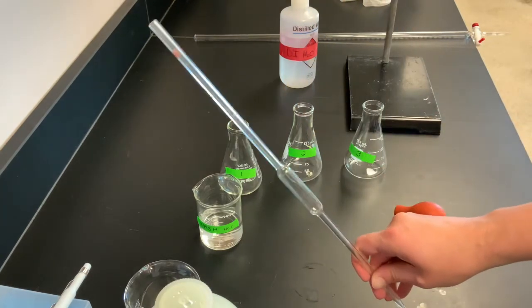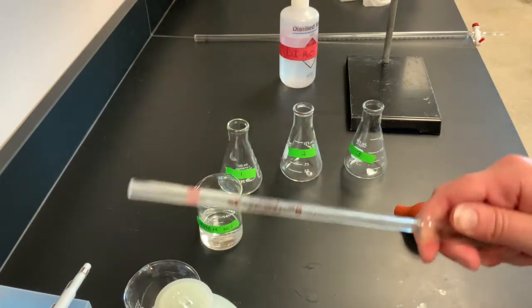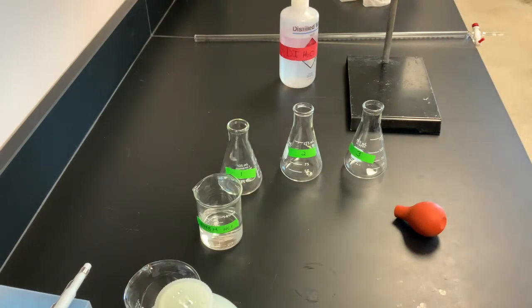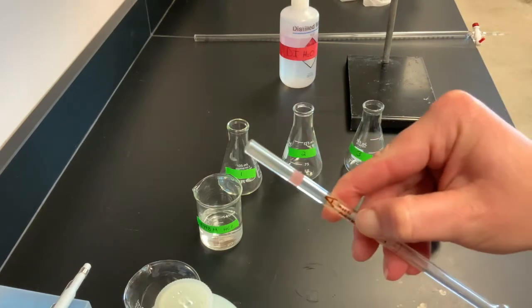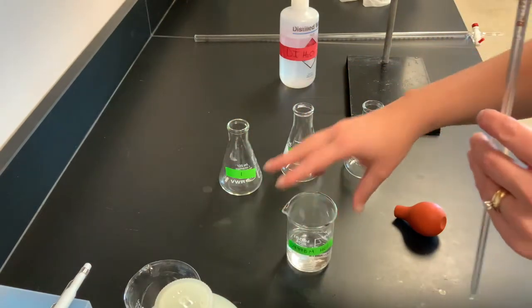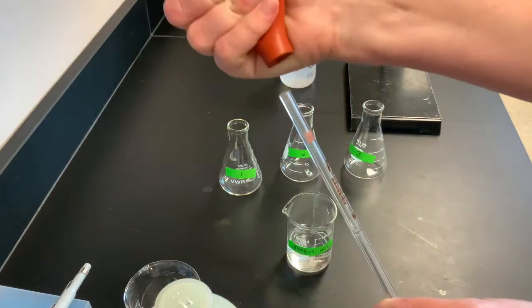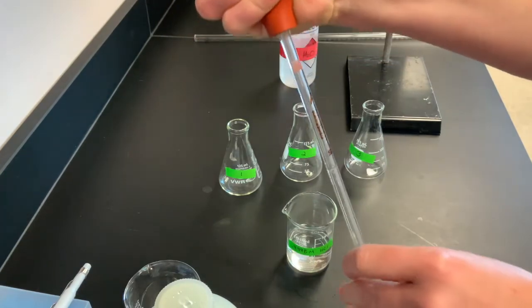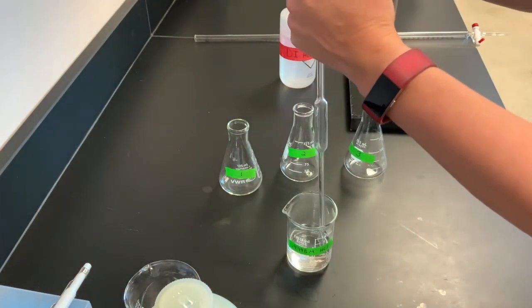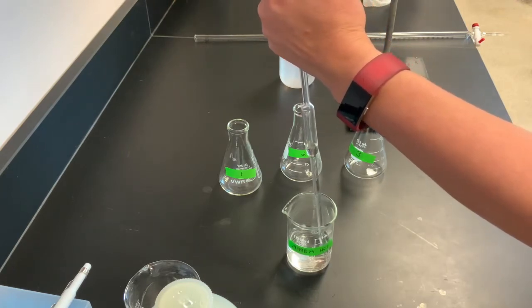So this is our volumetric pipette. Remember, the volumetric pipettes are going to measure out very accurate volumes. This particular one, we can take a look. It goes to 0.02 milliliters. So we're going to take our hydrochloric acid. Using that volumetric pipette, we're going to place our bulb on the top, just a little bit, not too far down. We're going to place our finger near the top so we can push it off easily. We're going to release the pressure on the bulb to draw the hydrochloric acid into the pipette.